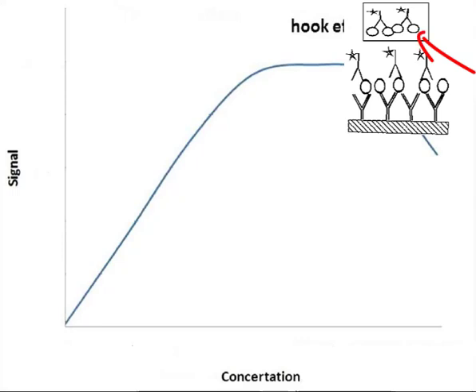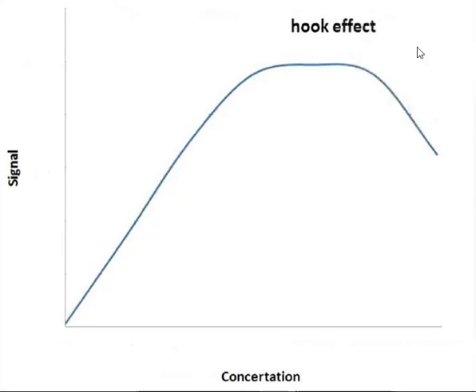As you see, free analyte binds to binding sites of detector antibody, and there is no more binding site to bind to the complex including capture antibody and analyte, and so the signal that you get from here is much lower than the actual signal. So that was the mechanism that happens during the making of this.